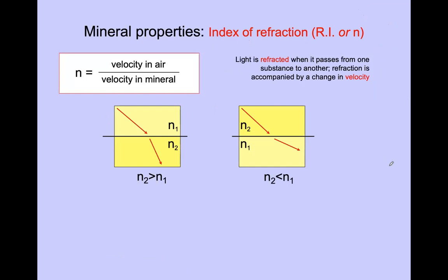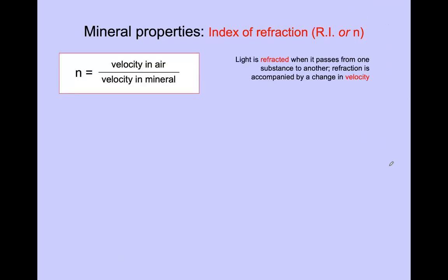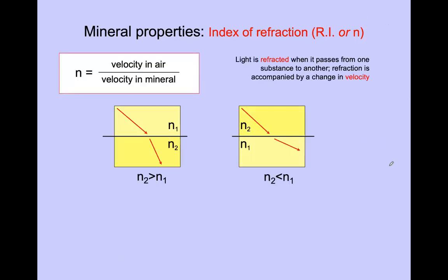The other feature is refractive index. That is also important, but you cannot directly measure the refractive index just by the microscope.